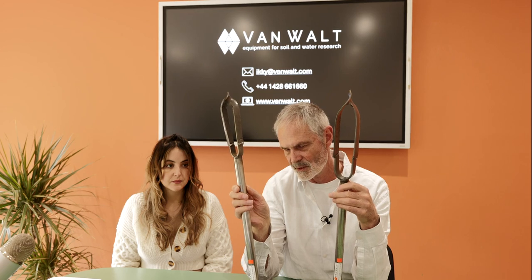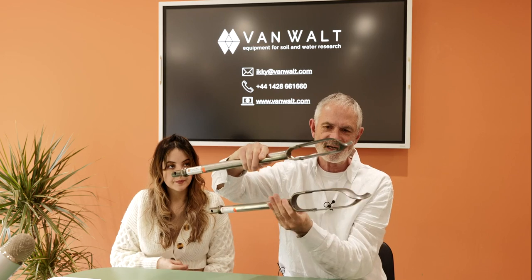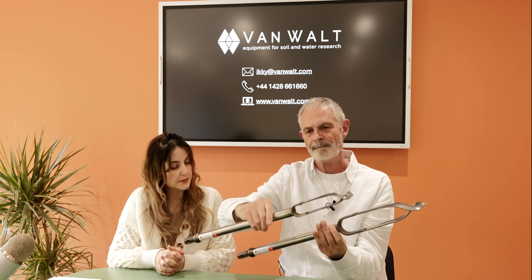These shapes here are really, really good for softish soils, and also very good for clays, for example. Easy to empty. Again, two sizes, 50 millimetre and 75. 50 millimetre, the small one in my left hand, and 75. I'm trying to get this so that you can actually see. The total length is 60 centimetres for these. So you would attach a handle to that, of course, and any extension rods.